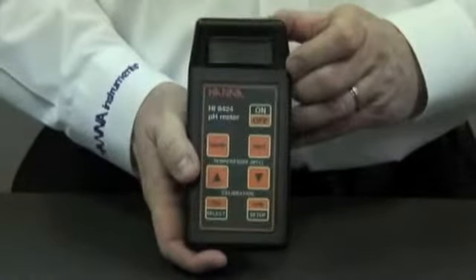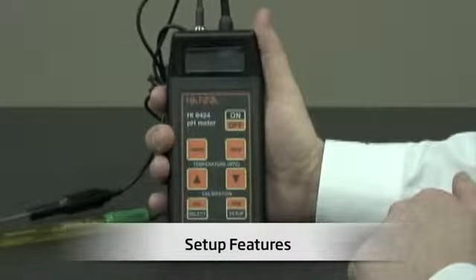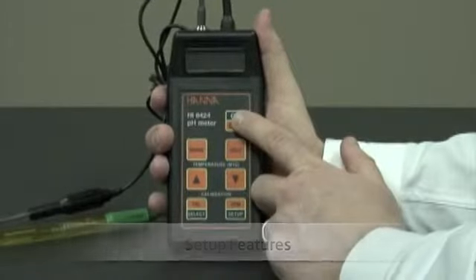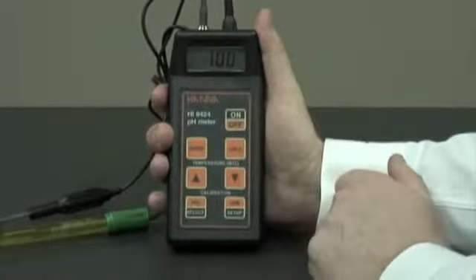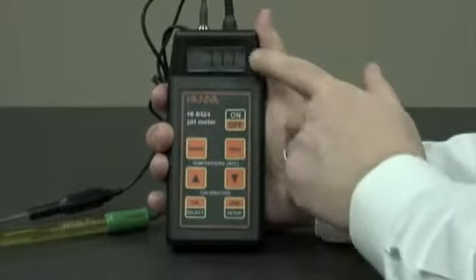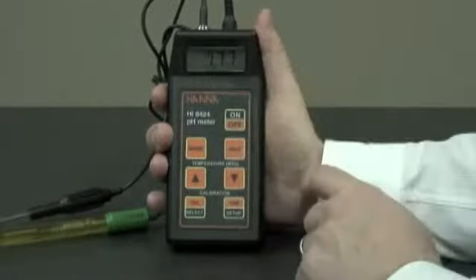Now we'll hook up the probes and turn the meter on. Now we've inserted the probes and we'll turn the meter on. Immediately, you'll see the battery percentage level, and now the display is showing pH.